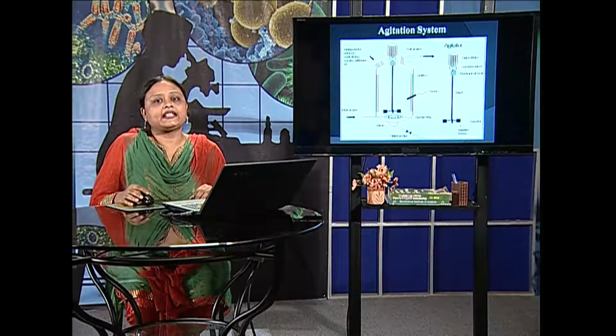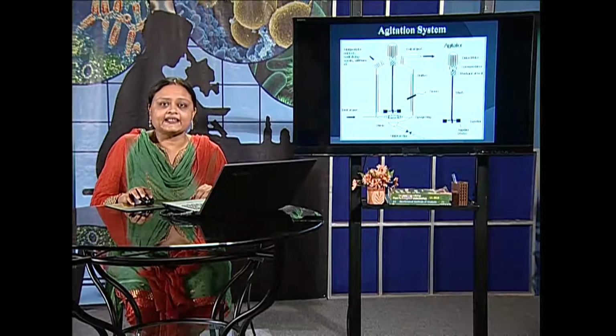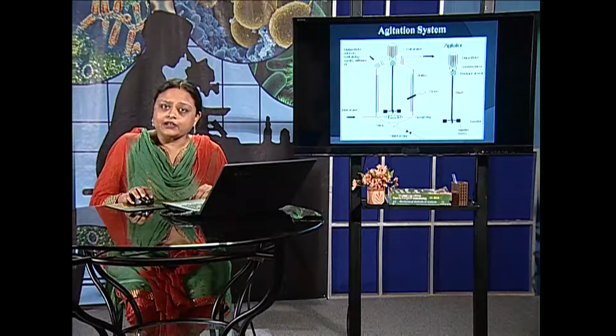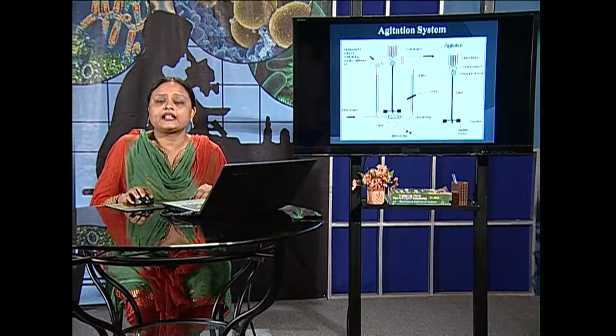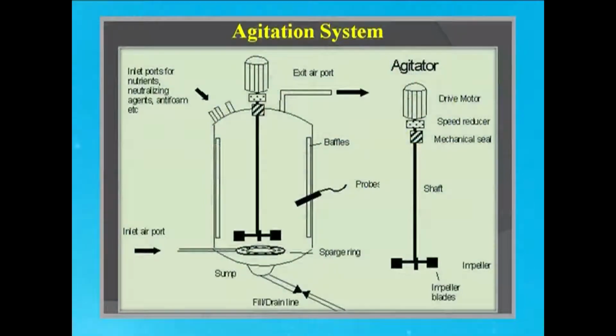Now, we will see the agitation system. It is very important that the contents inside a bioreactor are mixed evenly. There are bioreactors wherein no mixing is required, but in most cases, because it is a huge, plant-scale bioreactor, mixing is very important, and that is why the agitation system.